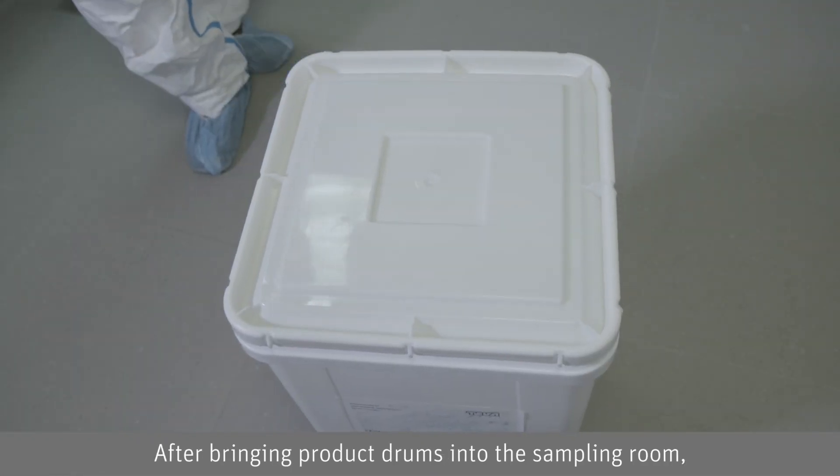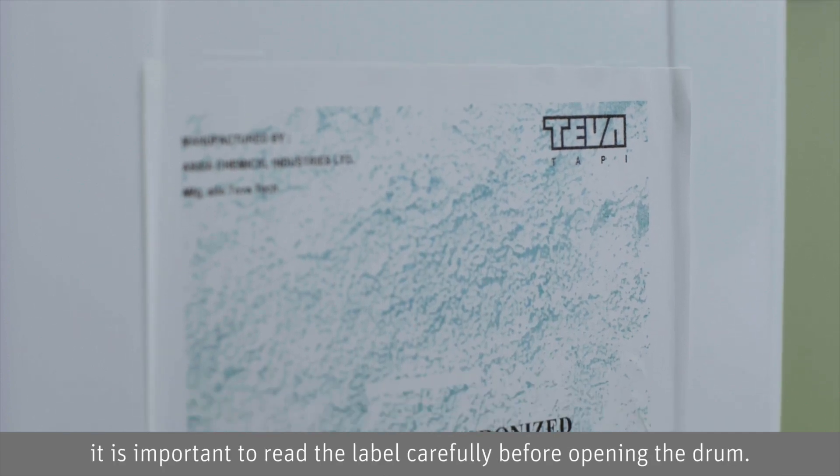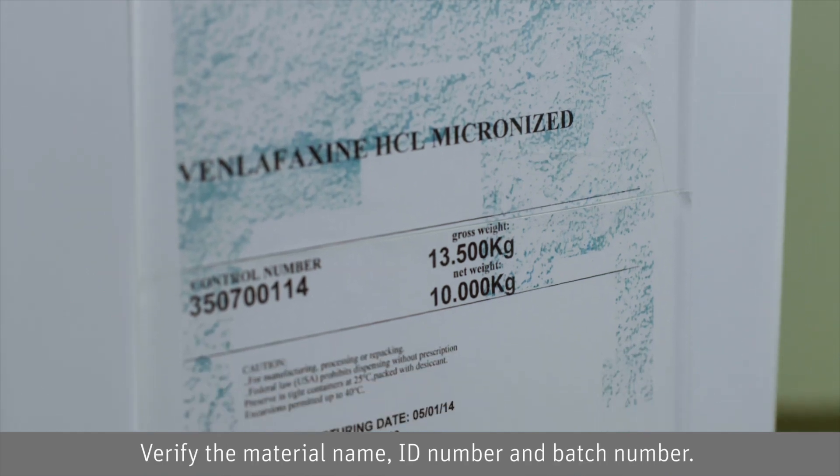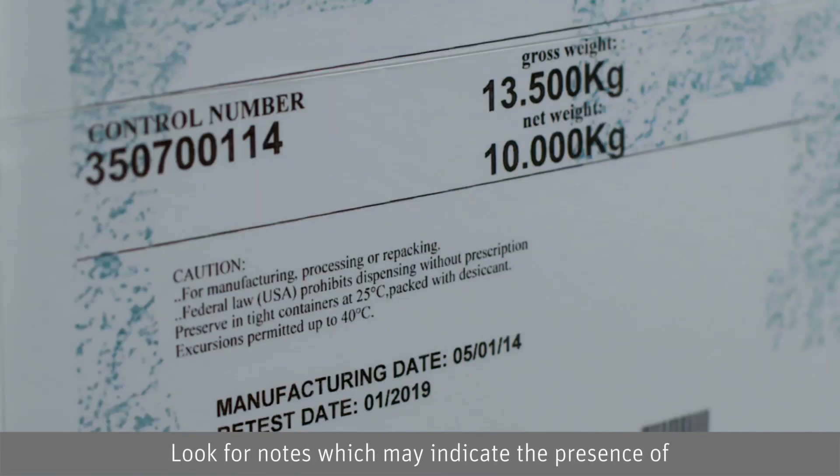After bringing product drums into the sampling room, it is important to read the label carefully before opening the drum. Verify the material name, ID number, and batch number. Look for notes which may indicate the presence of desiccants or other special storage conditions.